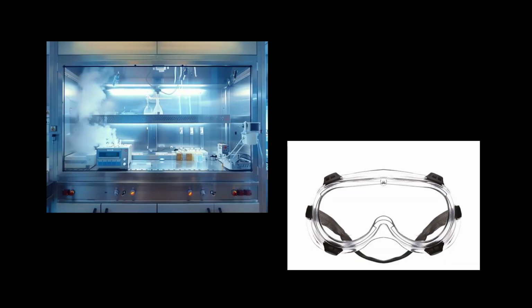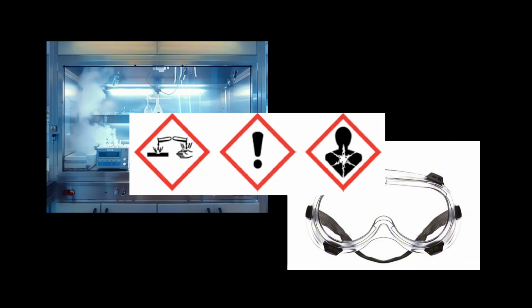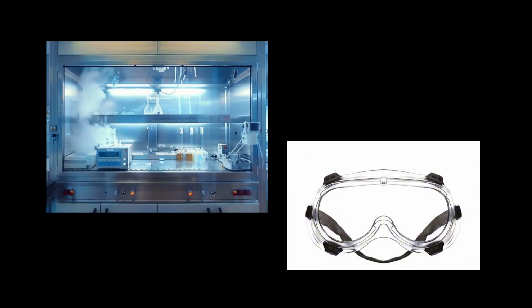Hey, this is just a reminder from Sam in post-production that you should be doing this lab in a well-ventilated area with the proper PPE, as some of the fumes can be irritating and even harmful to both skin and eyes. Thank you, and back to the video.